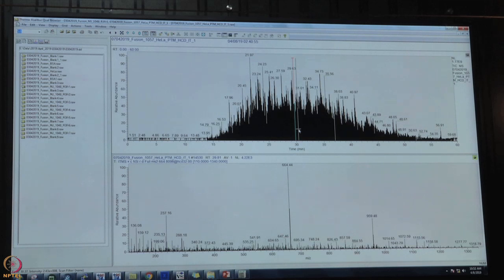So till now we have seen the different liquid chromatography parameters and the mass spectrometry parameters required for the success of an LC-MS experiment. As you now know, the charged species enter into the mass spectrometer and get fragmented. These fragments are then detected, and by use of suitable software, the identification of the peptide is revealed. However, just by looking at the chromatogram, one can easily deduce whether the sample run was good enough to be taken for further analysis.